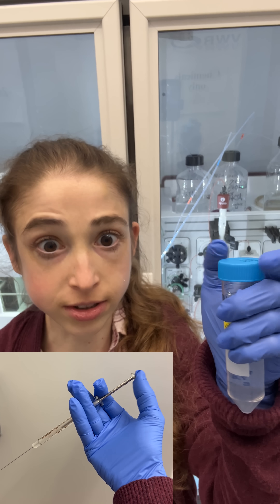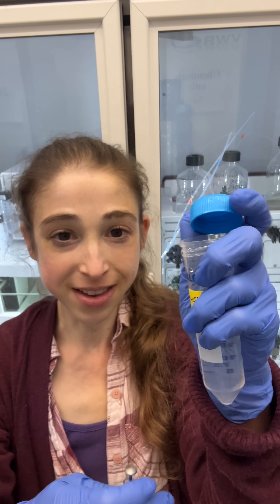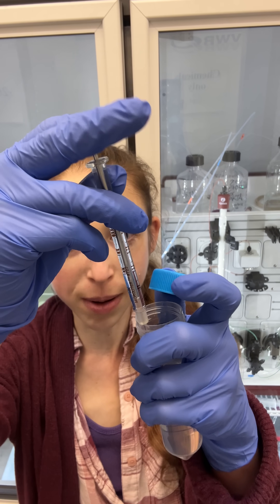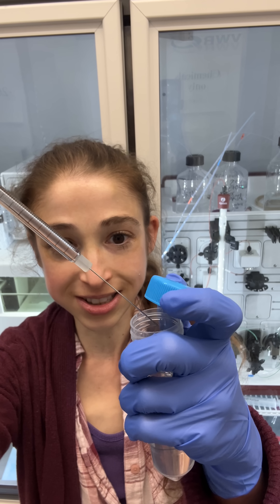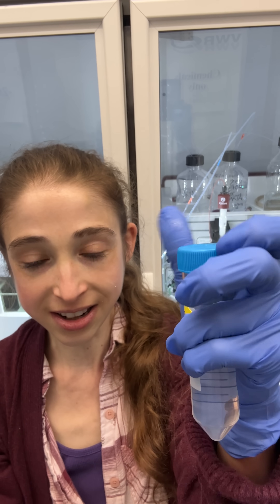Working in a lab, you get very ambidextrous, and one of the most important skills is to be able to uncap a tube with one hand, hold onto the lid so it doesn't go too far, and then with the other hand do whatever you need to do — pipetting, syringing, all of that — all while keeping this almost closed, so then you can just close it back up when you're done. Same, single hand, and voila.